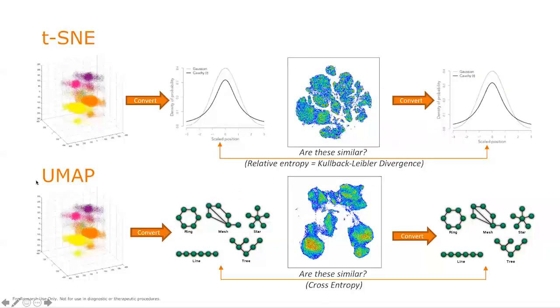parameter redistributing events. UMAP does a similar thing, but it does it using fuzzy simplicial complexes instead of Gaussian probability distributions. And it converts and compares those fuzzy simplicial complex manifolds over the data set using a method called cross entropy, but it's still an iterative process. And it seems like it's really in the initialization of the process where this global structure versus more local structure gets set. But they're both very relevant visualizations that confer nice graphical imagery to an audience.